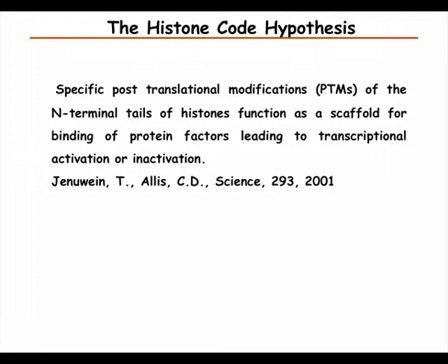I was wondering whether the enrichments we have done for modifications go specifically for certain phosphorylations more than others. Yes, that's always a question, whether all different phosphorylation sites will be enriched the same way, and it's probably not. The sequence around the phosphorylation site will definitely have an effect. We don't know what that effect is, but it will, yes.